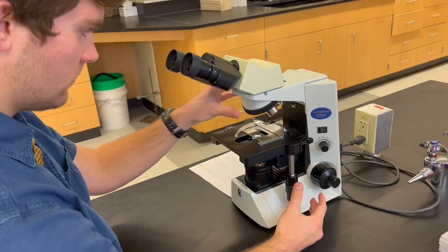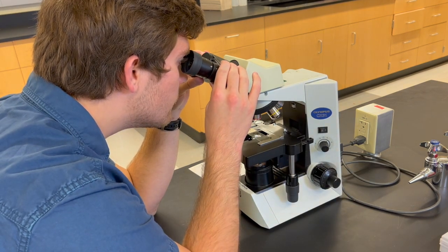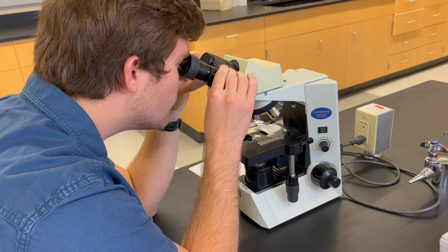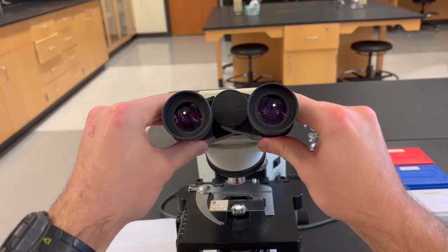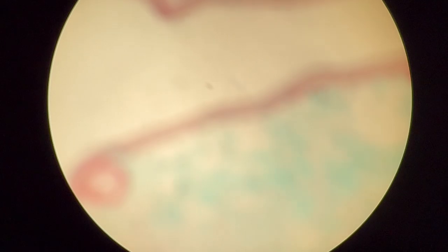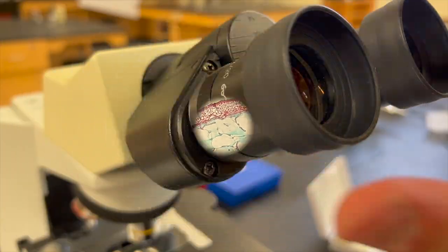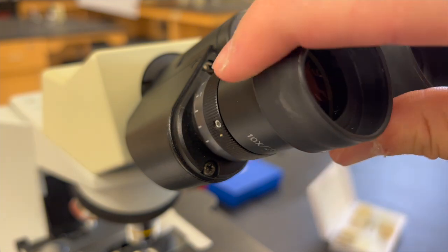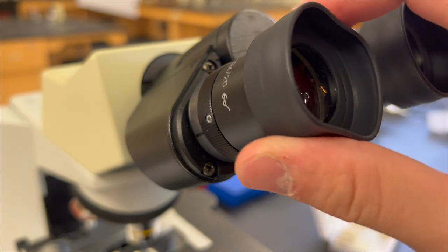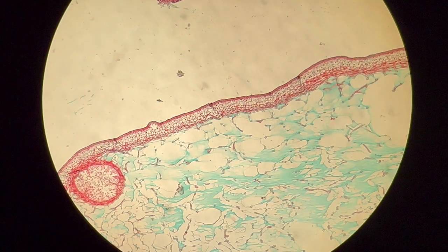Once the slide is underneath the 4x lens, which is the first lens you should use when focusing on a specimen, you can adjust the distance between the ocular lenses by gently sliding them together or apart in order to match the distance between your pupils. Following this, look through the ocular lenses and use the coarse and fine focus knobs to bring the specimen into full focus. Once that's complete, fine-tune the left ocular lens, allowing for increased definition. There should be no blur and no unclear areas of the specimen.